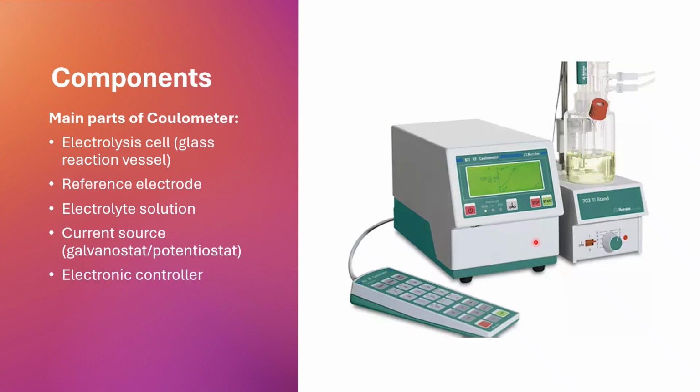And then the electronic controller. Here where you keep your vessel, there will be a knob. Based on the knob, you can adjust the mixing of the solution by having magnetic beads in this solution. And the endpoint detector sensor is inbuilt into the equipment, by which when saturation occurs, it will automatically detect your endpoint and provide you the result. And then the display and recorder, where you can see live the saturation point of the water content.